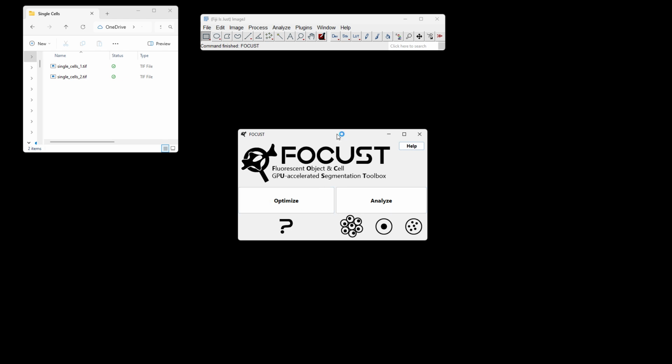When it comes to optimizing segmentation parameters, it can be quite tedious to go back and forward, trialing different filters and thresholds and methods, and that got old really quite quickly, especially on 3D datasets. So I built the optimization mode so that you could iterate through a directory of sample images and refine your segmentation in a slightly more interactive fashion.